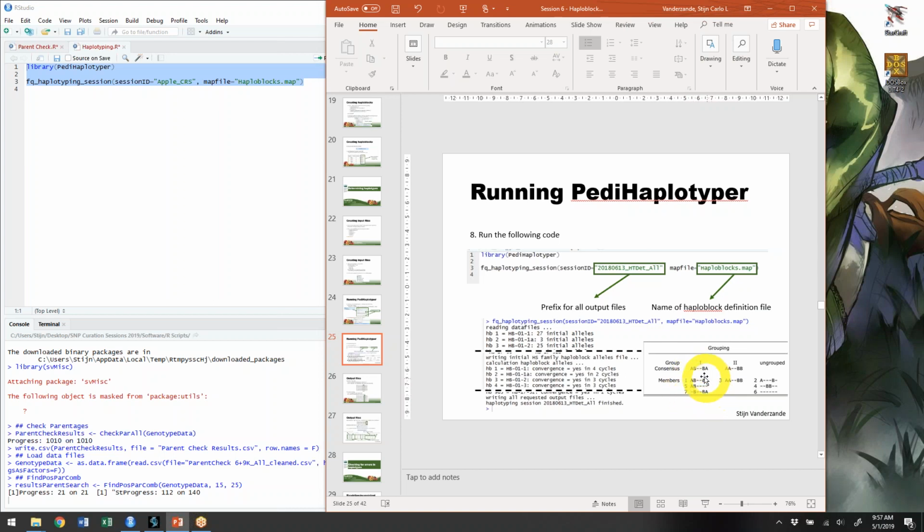But they're all sharing a common pattern, and the common pattern overall would be AB-BA. Whereas this individual is AA-BB, and so the second A here is already not matching any of these B's, so it's a separate pattern. So it's put in a separate group.